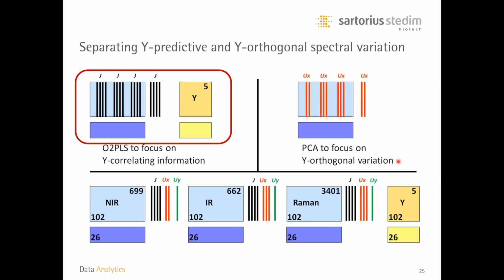So the first model we can zoom in on is this model, just to see what things look like when we look across all the measurement platforms, what information is there, is there any overlap between the different spectral techniques, and we also take into account the fact that the Raman will not dominate the model in an undue way simply because it has most variables.